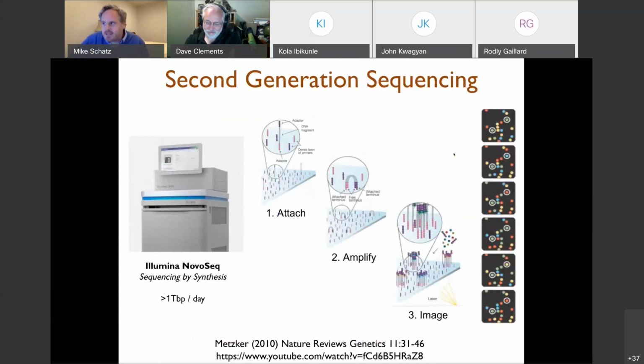So in the interest of time, I'm not going to go through this in great detail, other than to say Illumina sequencing is basically a very, very fancy digital camera that can take pictures of DNA molecules that have been labeled with fluorescent dyes. We take our molecules and prepare them, where we have strands of DNA, and we're going to synthesize complementary strands with fluorescent dyes on complementary nucleotides. We shine a laser on it, and it'll glow different colors. We can then do image processing to decode those colors back into nucleotides A, C, G, T. So Illumina sequencing is a very fancy digital camera, followed by some image processing that can interpret those color dots to give us huge quantities of DNA sequencing.